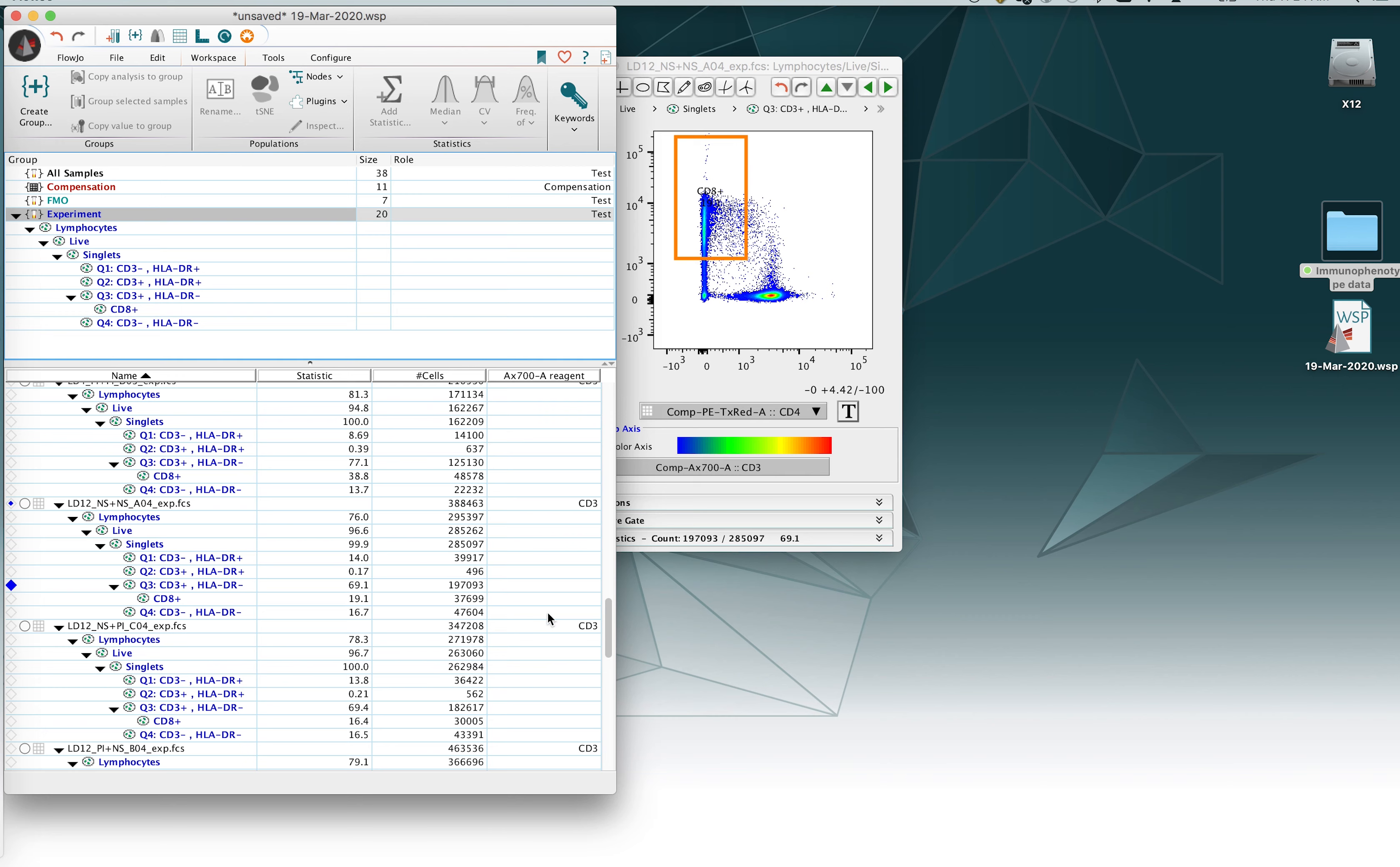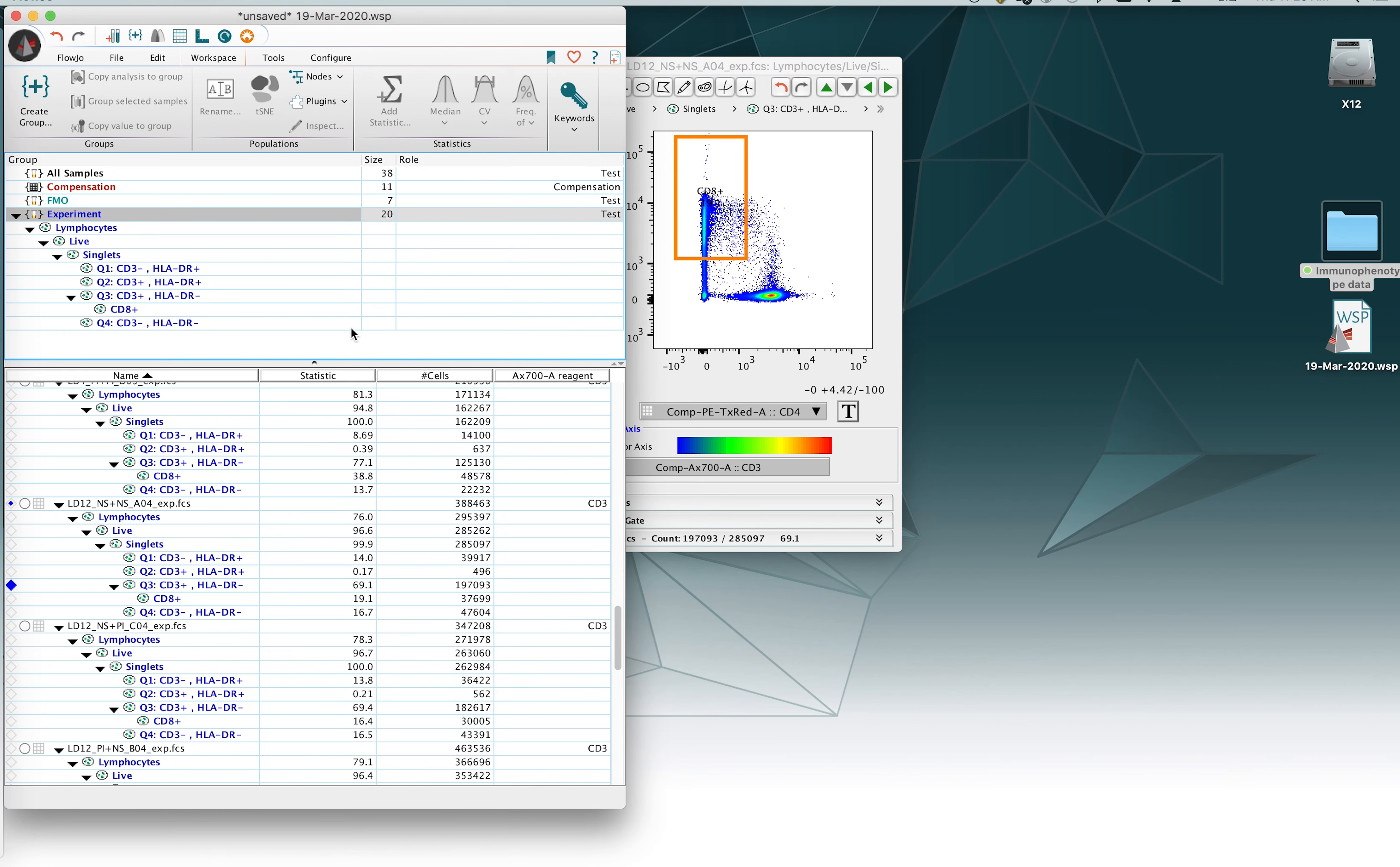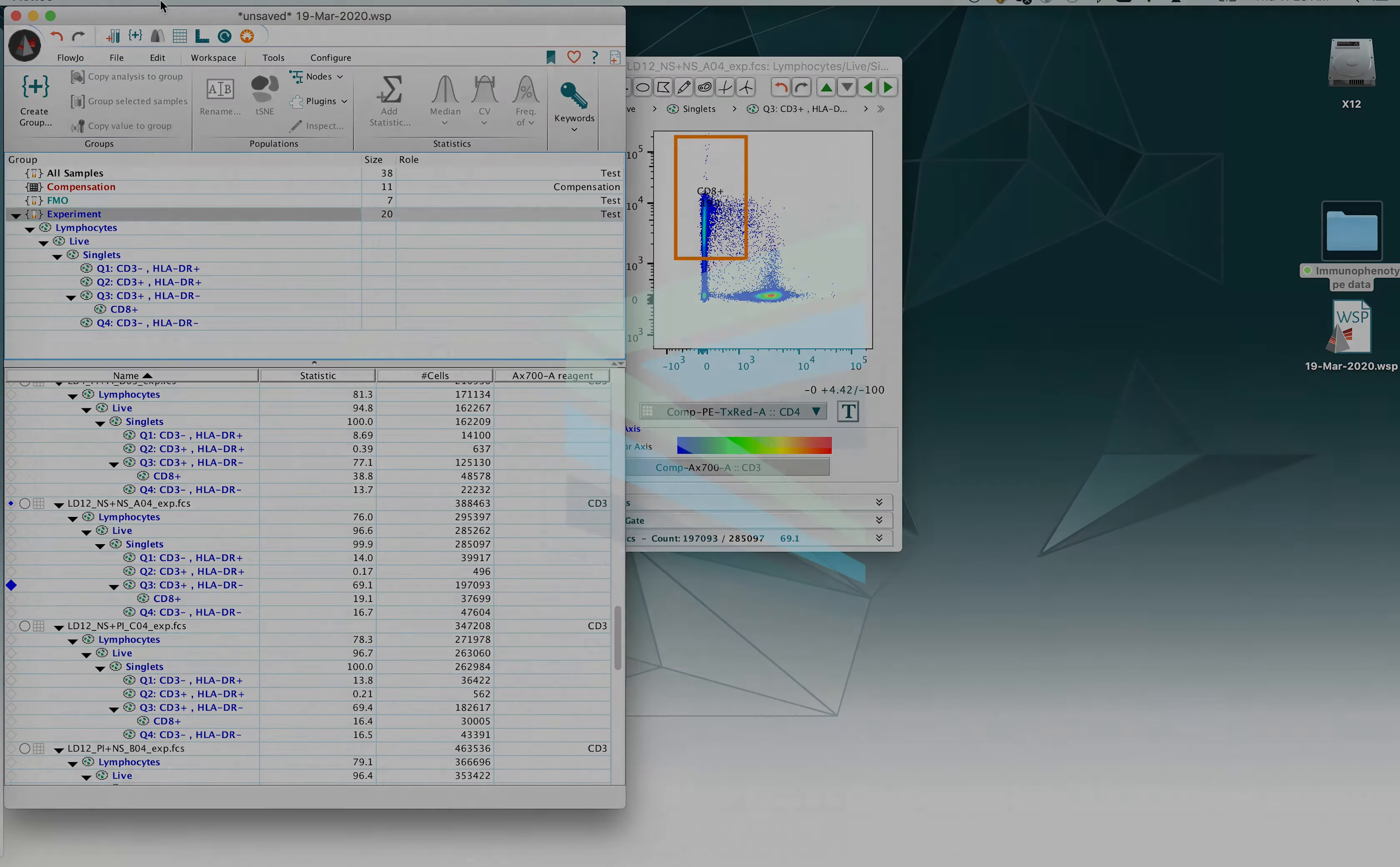That completes our copying gates to the group, synchronizing and deleting or editing an existing gate. Please join us later for other videos related to the FlowJo workspace and manipulating your gates or files. Thank you.